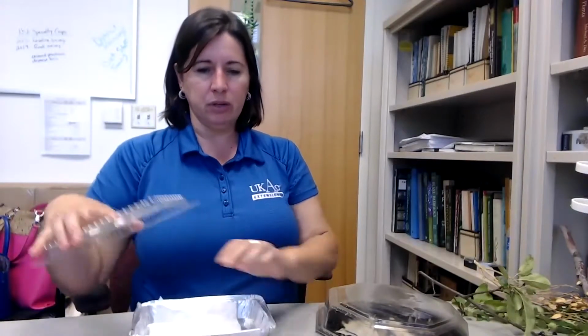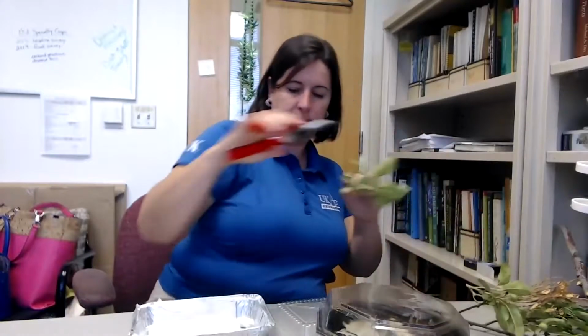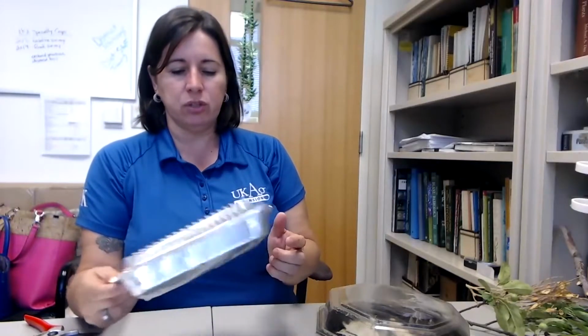And then putting your sample in to induce sporulation. And then putting the lid on. Here we go again with the glare. These moist chambers can sit just on your desk at room temperature. Usually if you do it one day, you can come look at it the next day. It usually only takes about 12 hours. After 24 hours, you're going to start seeing the growth of saprophytic fungi, and that is not going to give you a diagnosis. So it can't stay too long.